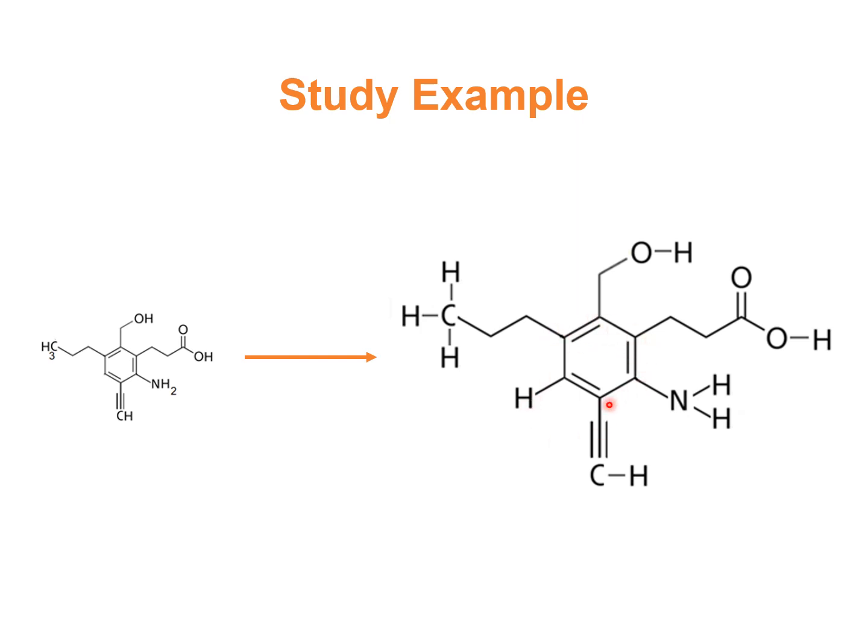5 carbon atoms are substituted. So in this benzene ring, there is only 1 carbon which is having hydrogen. So this particular structure contains alkyl substituents, hydroxy, then acid, then amine. This is nothing but double bonds, then a triple bond.